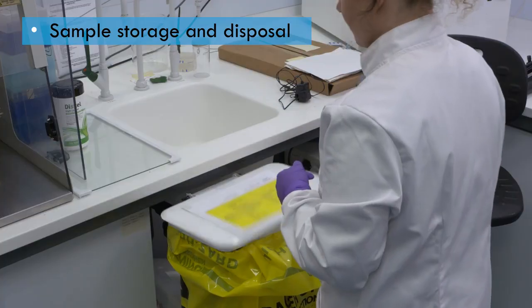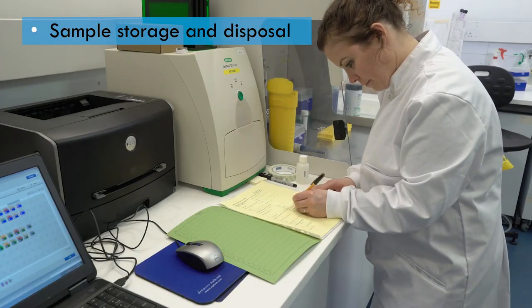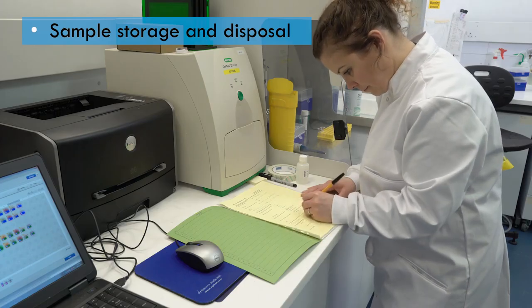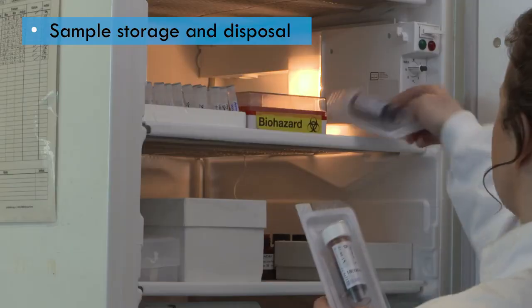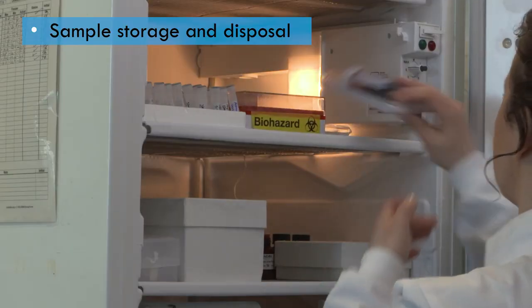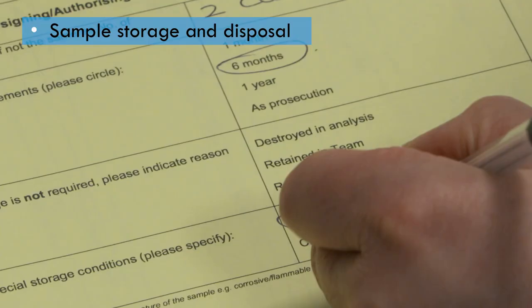In any of these instances, the fate of the sample should be recorded so that the sample journey through the facility can be tracked. Where samples need to be stored, the type, location and duration of storage should be agreed and recorded.